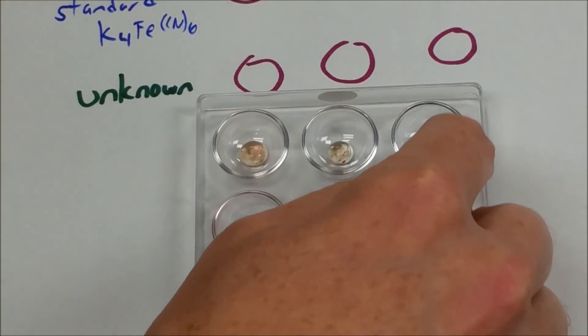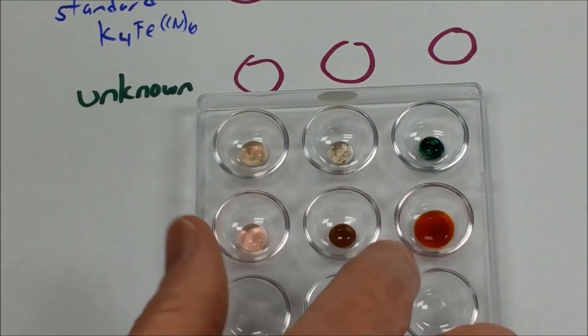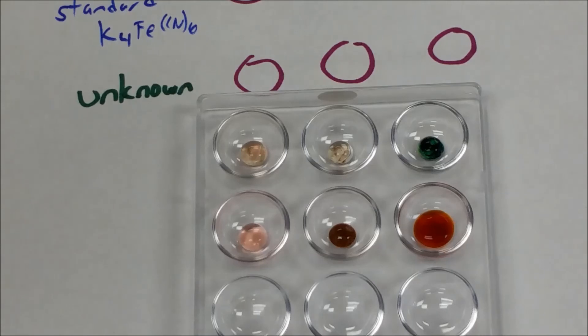And then this one we're actually seeing Prussian blue form, so we're seeing this blue with a hint of the remaining yellow kind of forms a green color. And then over here we're seeing a completely different orangish kind of mix.